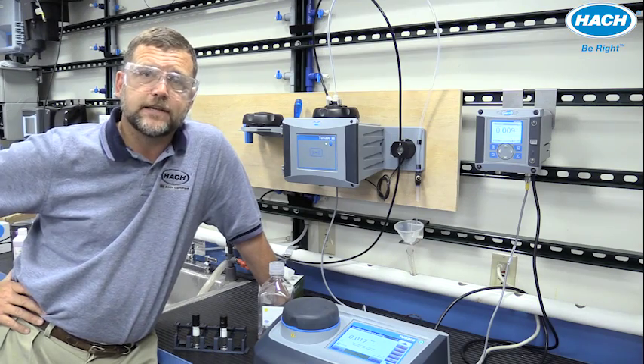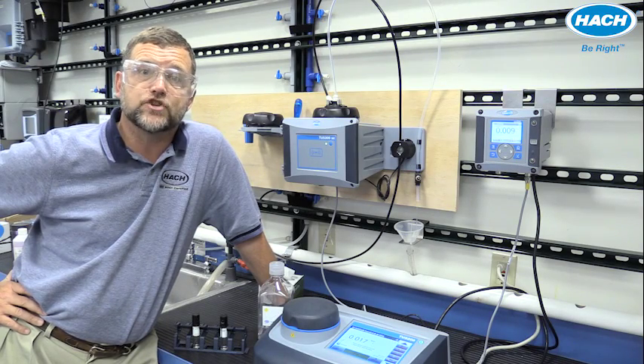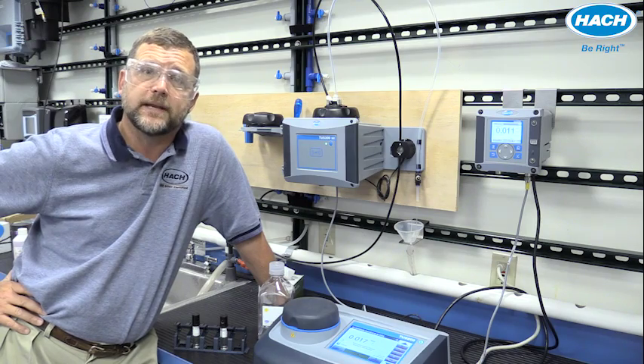Identical optics in the TU5 series turbidimeters helps provide measurements without uncertainty, so that when you see a change in turbidity readings, you'll know it's a change in your water.